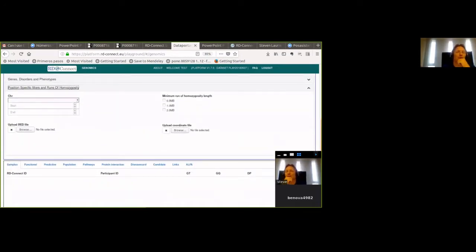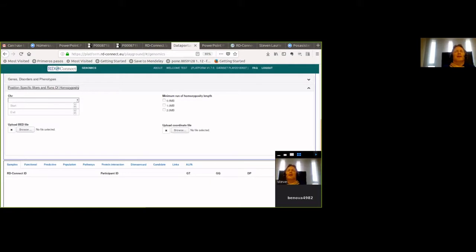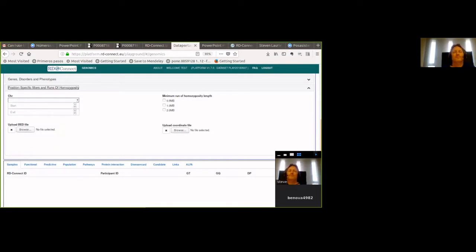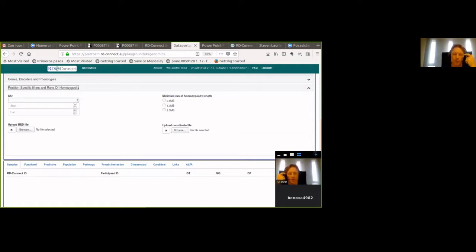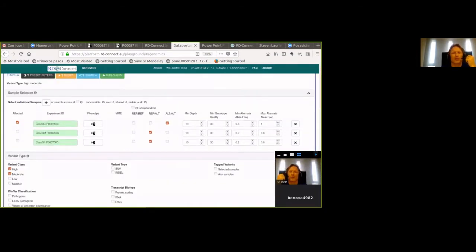If you're interested in a particular chromosomal region, you can upload a BED file with a series of regions of interest, or a coordinate file for specific positions. Another thing we pre-calculate for all exomes and genomes is runs of homozygosity — long regions where the individual is homozygous, indicative of identity by descent. If you're looking for autosomal recessive disease and the parents are consanguineous, it's very common to find the causative variant in such regions. You can add as many or as few filters as you want and run the query.